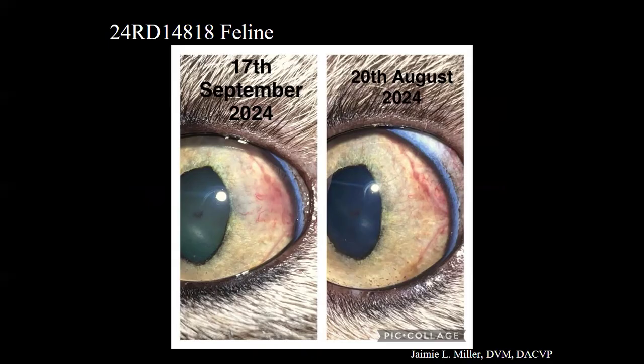So my first case that I have today is from an 8-year-old male neutered Maine Coon cat. It comes with the history that this cat presented in February of 2024 with bilateral anterior uveitis. The left eye, which is what we received, was much worse than the right eye.